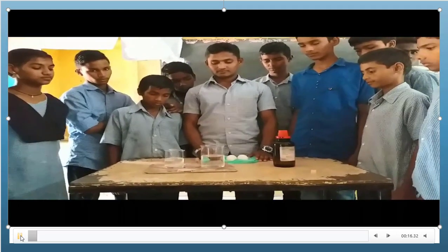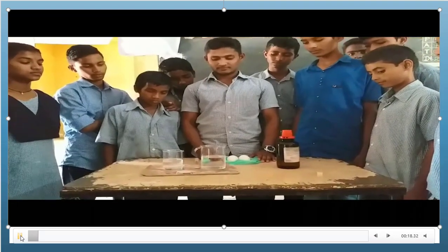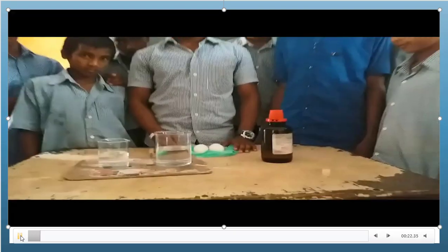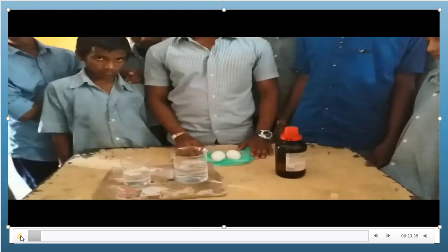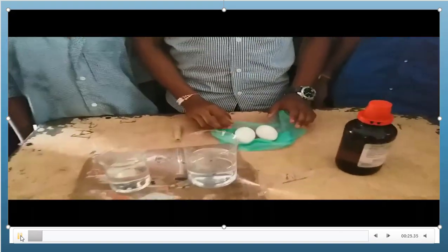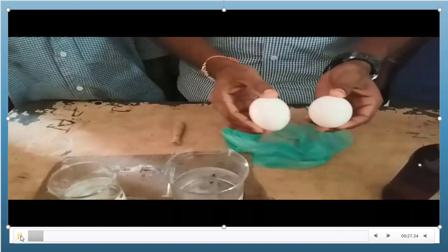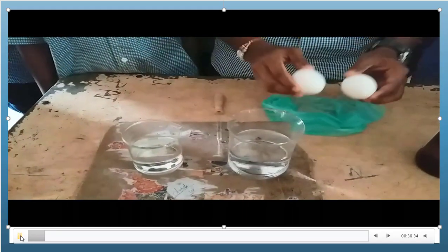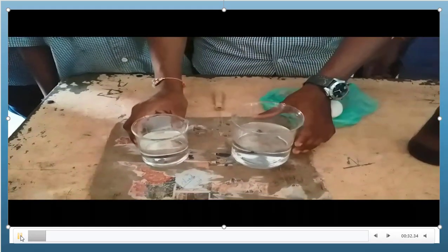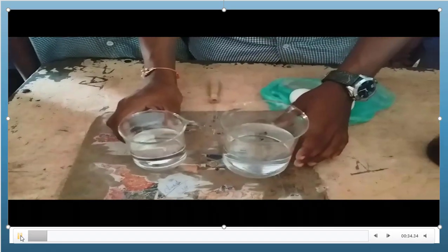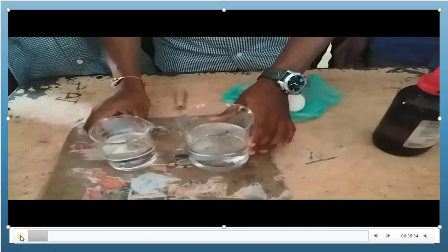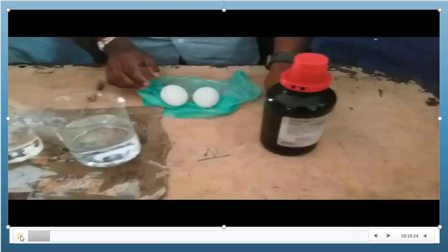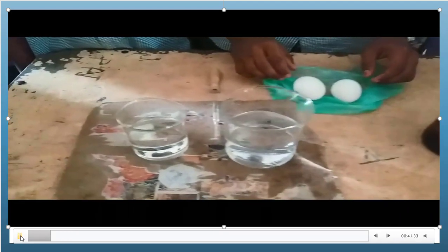Here, my students are performing the experiment — osmosis with the egg membrane. First, what we have to do: we have to remove the egg membrane from eggs. For that, we require two raw eggs, beakers with water, and concentrated hydrochloric acid.